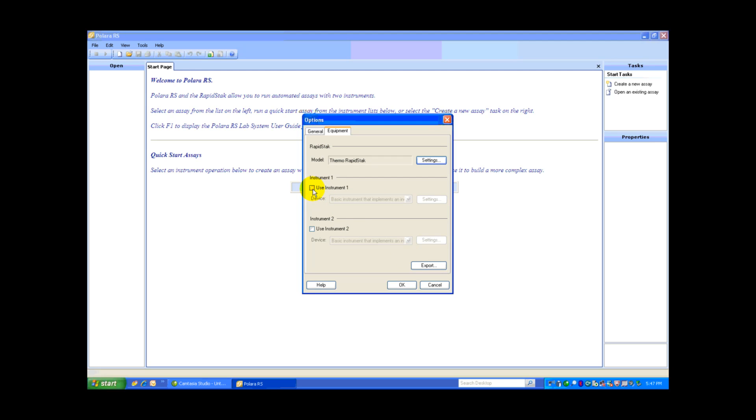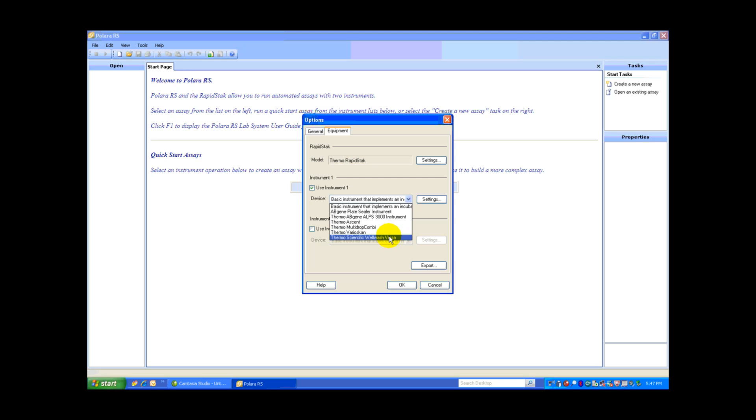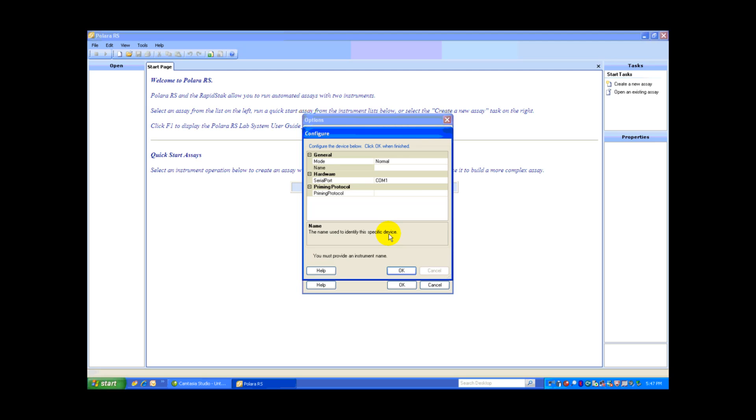Next, I'm going to add an instrument. I'm going to say Use Instrument 1, and I need to identify what that instrument is. I've already selected here the WellWash Versa. This driver was installed earlier. Again, I'm going to leave it at Normal mode.